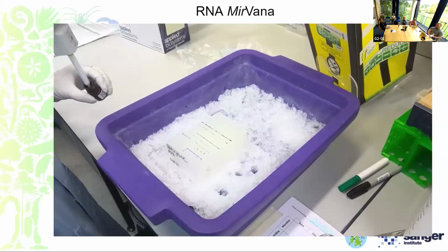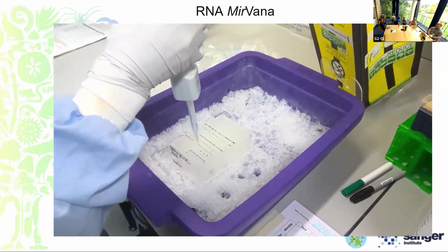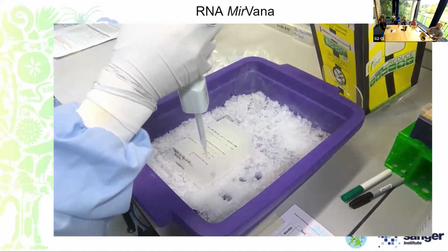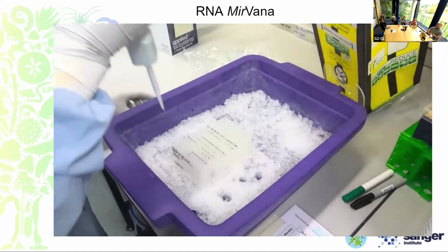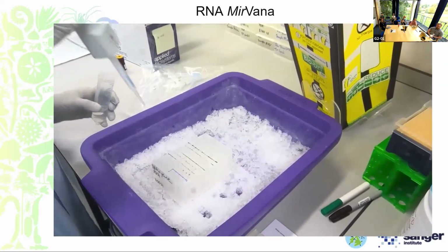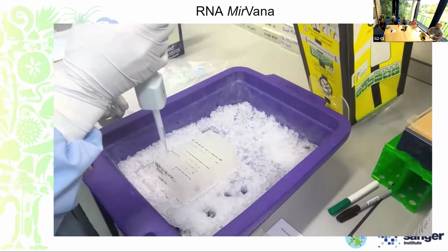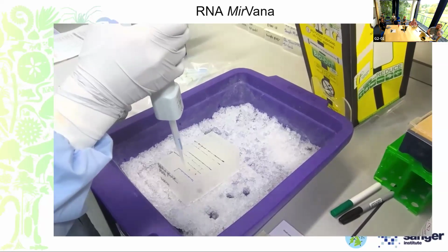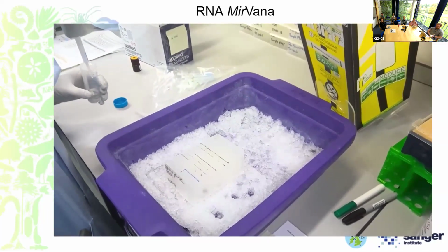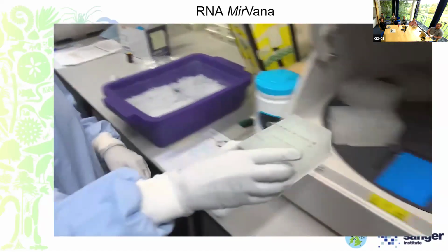So the DNase plate, as I said, has 50 microliters within it, and this is made from a turbo DNase buffer and a DNase enzyme. And yeah, you have to add the 100 microliters of isopropanol and the 50 microliters of the rebinding buffer separately to each sample. So that was the rebinding buffer, and now it's the isopropanol being added. But once this has been added to the DNase plate, you can pop that back in the Kingfisher and resume the protocol, and it will continue the run for the final wash steps and the elution. There it goes back in now.